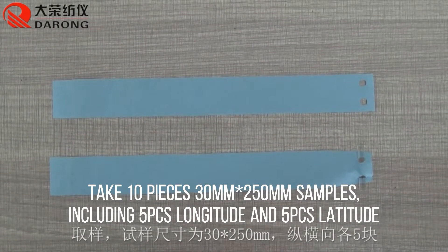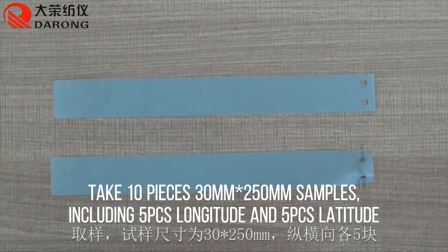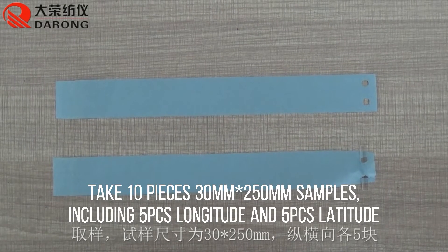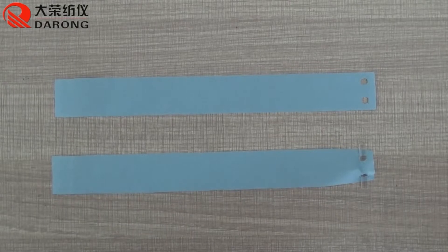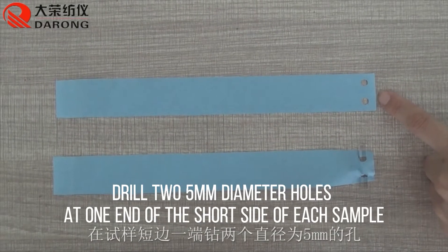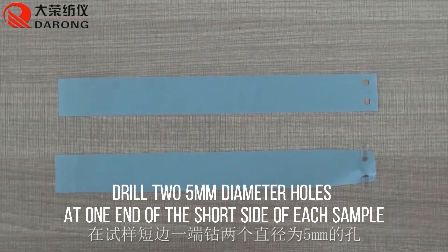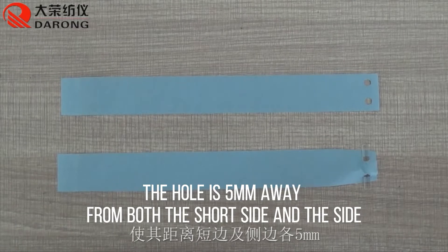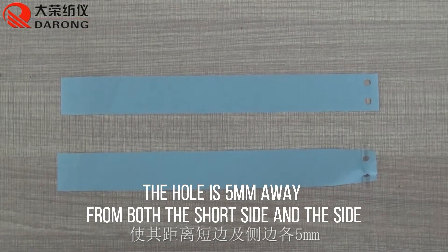Take 10 pieces of 30x250 samples, including 5 pieces in the longitude direction and 5 pieces in the latitude direction. Drill 5mm holes at one end of the short side of each sample. The hole should be a set distance away from both the short side and the long side.